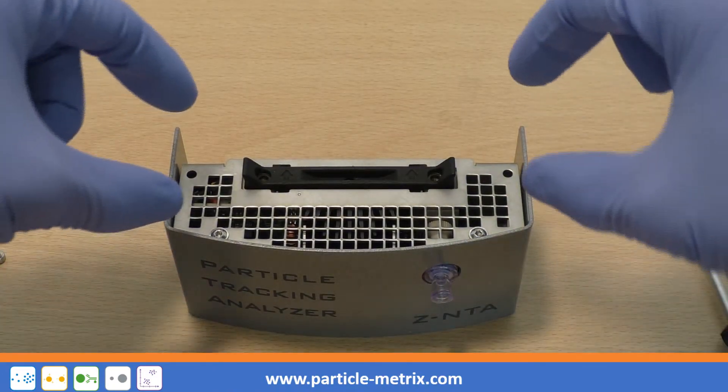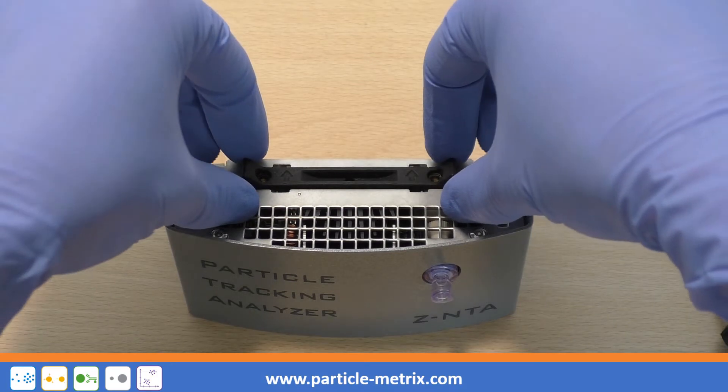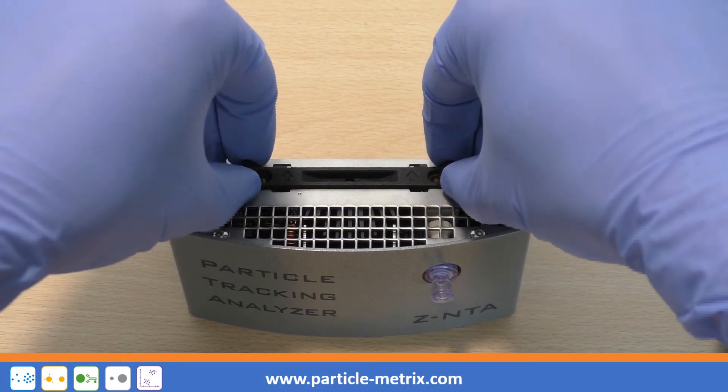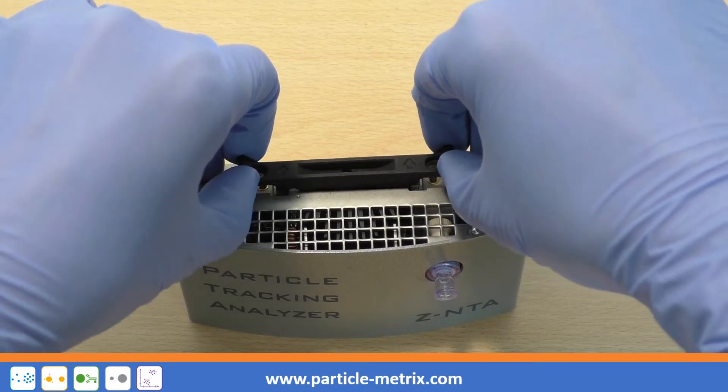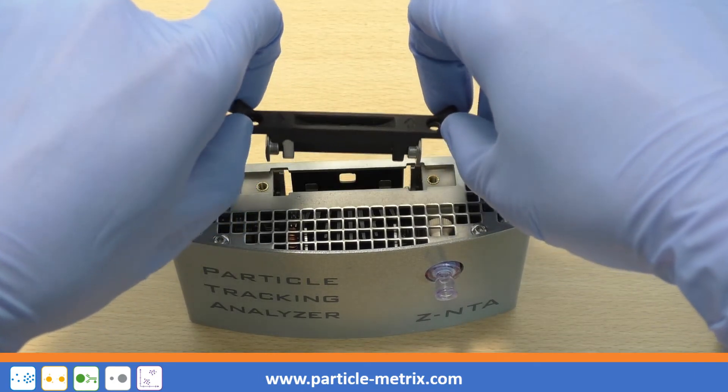Hold the protruding parts of the cell carrier with your thumb and forefinger and pull the cell carrier slowly and evenly upwards out of the cell assembly by applying some counter pressure with your middle fingers.